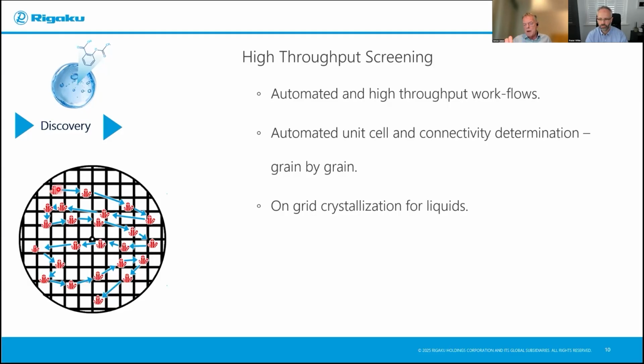Each one is a pipette of picoliters of material taken from the high throughput liquid-based screen that you may be operating. The liquid typically evaporates very quickly, and that lays down solid onto the grid that we can then step through in the same manner to do our characterization. Now, another benefit of this being a unit cell-based technique is that we can match directly to crystal structure prediction.